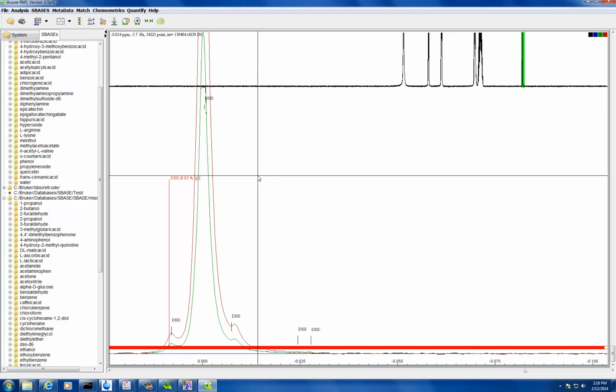Wicked. So now that is saved. That's test 2, a method in that folder that you released for ICON. Okay, so let's switch and have someone else go. The next person is going to run a sample using ICON with the method you just made. So whoever wants to take it next.